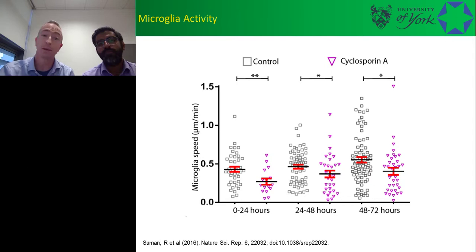And this is really important. Is it just an outlier? There shouldn't be outliers. This is a cell that is behaving differently. And you've got to think, why is it behaving differently to the rest of the population? If this was a chemotherapy drug, you know, this drug's working really well. It's affecting 99% of the cells, but 1% of the cells, it doesn't react with it, or it behaves opposite to what you want it to do. So it's that 1% that ends up killing us, not the 99% that are affected. So this outlier is actually really, really important. And I think I've just called Usain Bolt a murderer at the same time. So if he doesn't get done for drugs, we'll have him on something else as well.